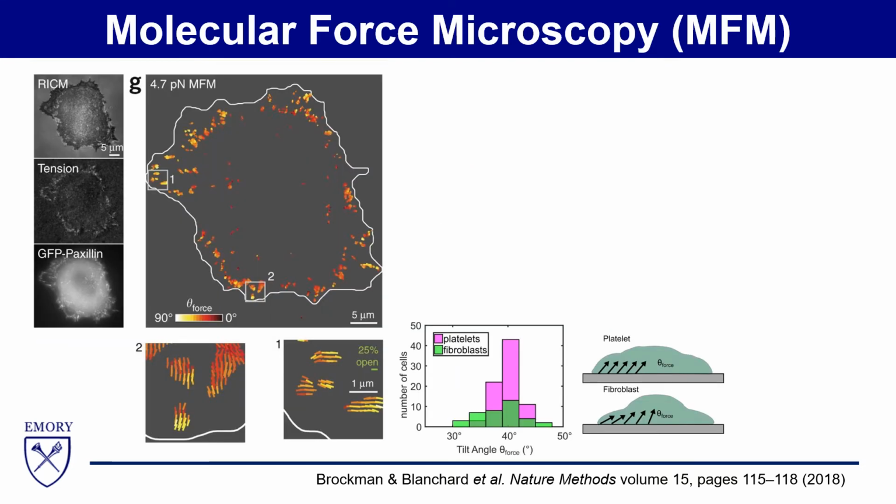The lamellipodial edge exhibits forces that are oriented primarily towards the center of the platelet, and the inner region, on the other hand, exhibits forces that are directed primarily towards the central axis. You can read more about this technique, which we have named molecular force microscopy, at Nature Methods. We have also used MFM to characterize integrin forces in fibroblasts. In this case, we can see that forces are concentrated to focal adhesion structures that point into the cell centroid.